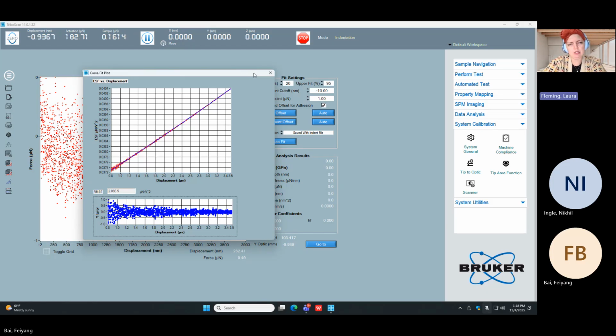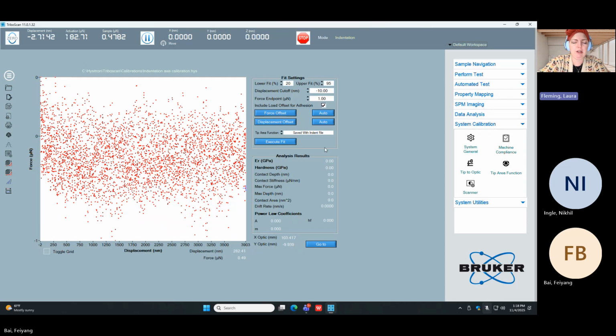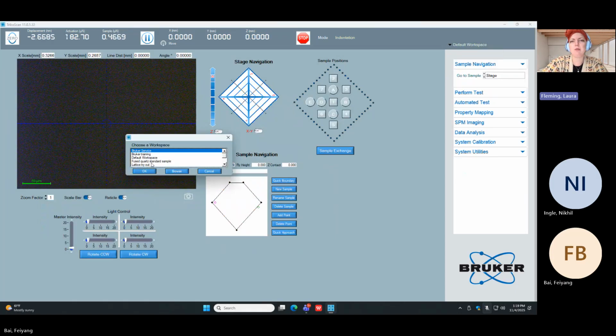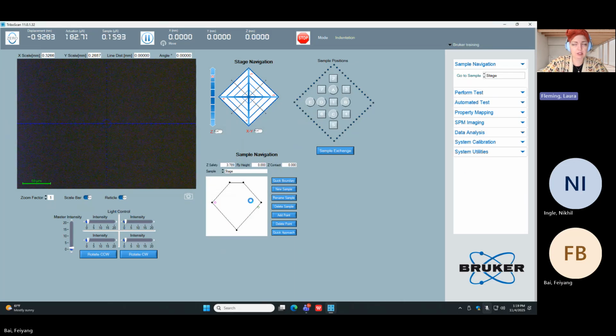So when you do your fused quartz indent, what is the variation away from the expected reduced modulus and the hardness on the fused quartz standard? Okay. That gives us a much more meaningful number, right? Because the error cal is really just how well the transducer can calibrate to itself, versus getting actual numerical results, because there's so much more that goes into getting reduced modulus and hardness on your sample than just the calibration of the day.